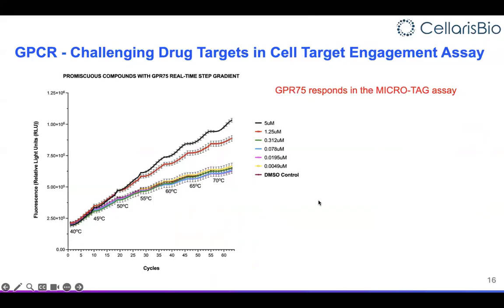So how did we deal with this particular construct? Well, what we wanted to do is first of all, determine whether GPR75 works in our microtag assay system.